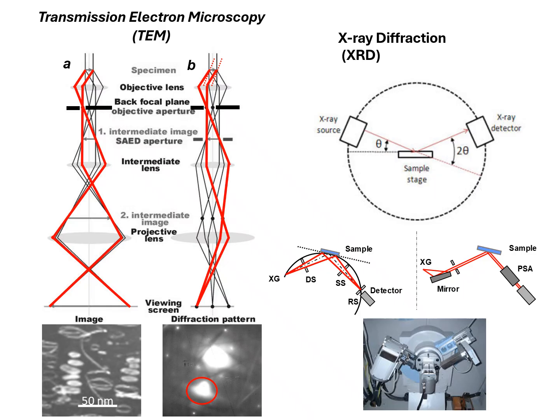And I'm going to focus on the images that one obtains and how you use them to analyze microstructures, especially in irradiated materials.